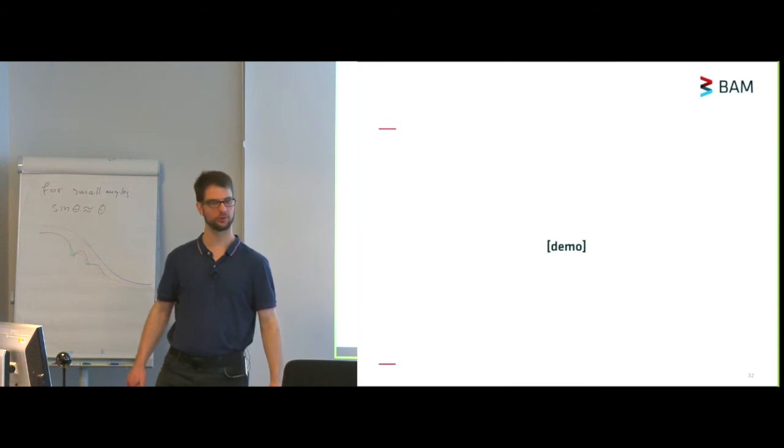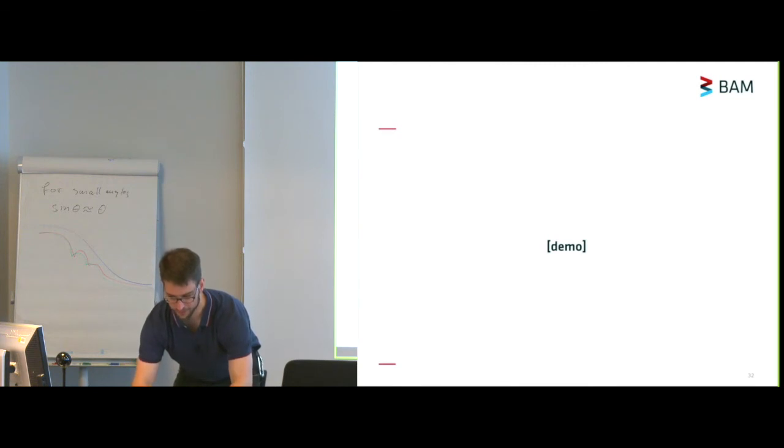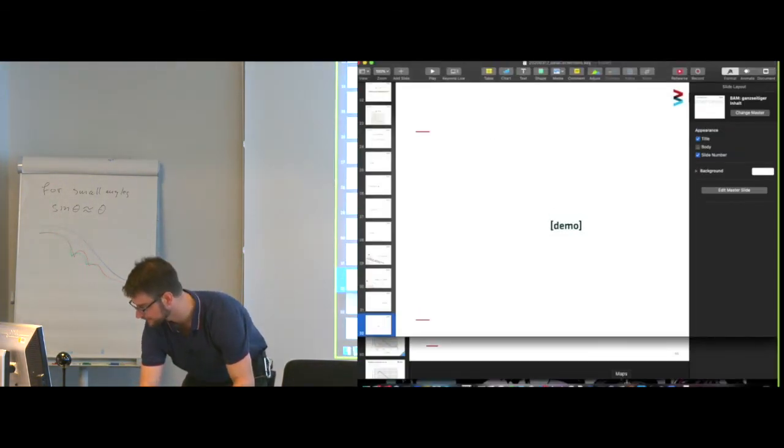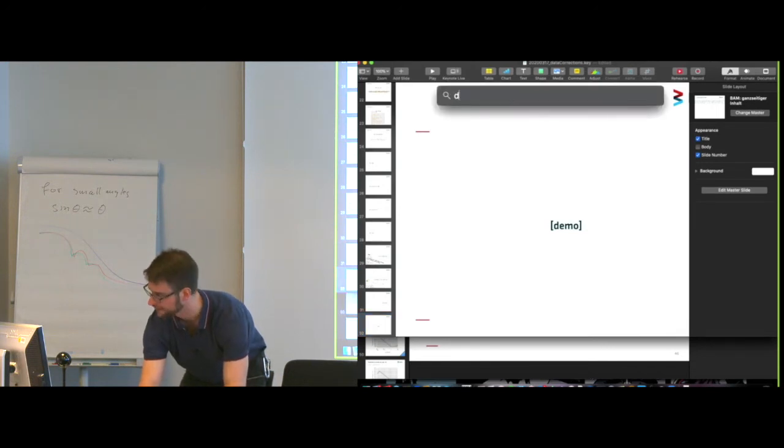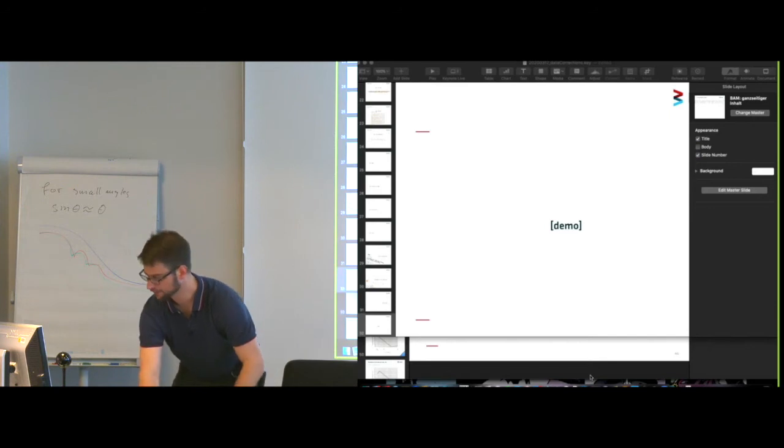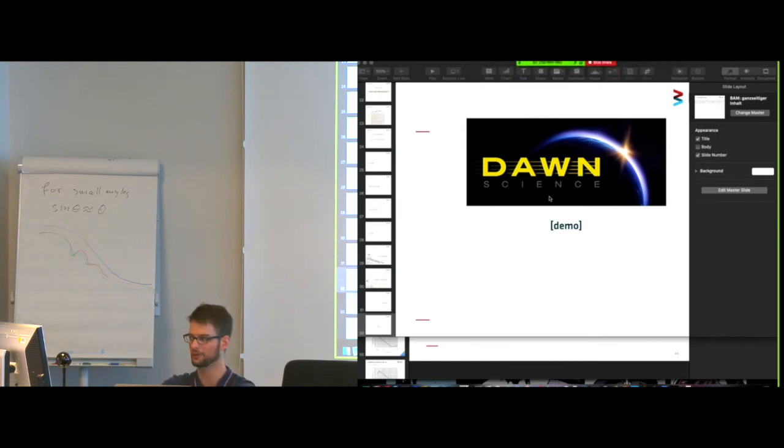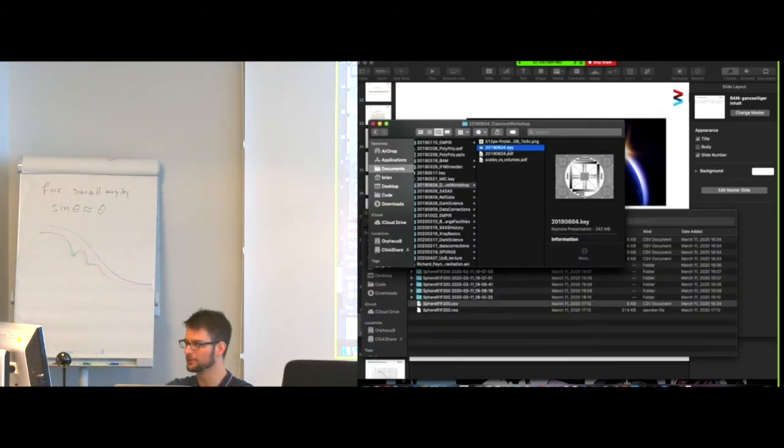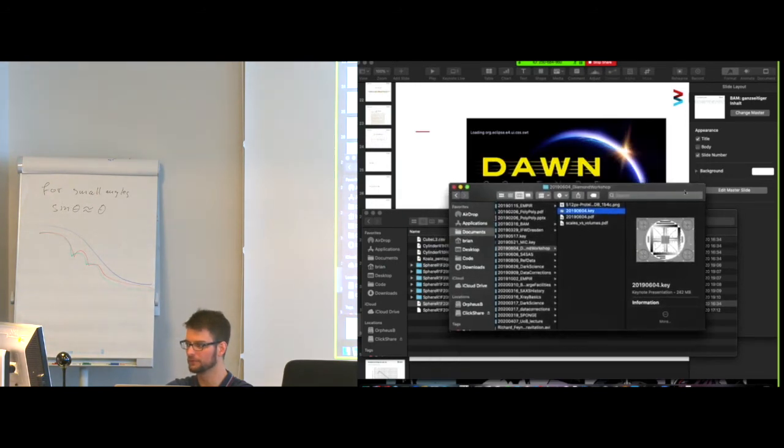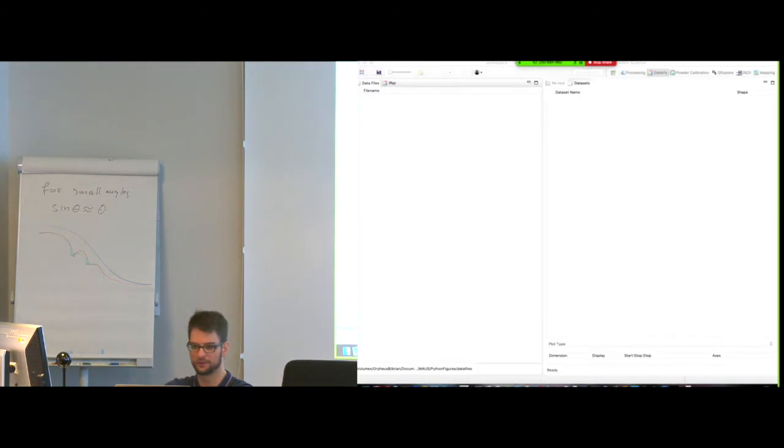So, I can show a brief demo about how this works. And then, for that, I need to hope that I actually have Dawn started, because that can take a while to start. So, just like Tim has shown you, this you can actually download from a website called dawnsci.org. There you'll find the latest version, which is also what we're using. And unlike Tim, I will not use that file browser that he had, but I will just drag in things from my own file browser. So, you can use a Windows file browser or a Mac file browser to find your data files and drag them into the windows.